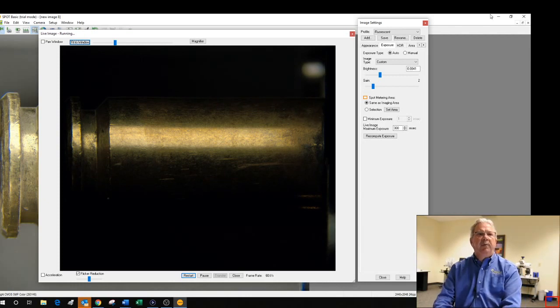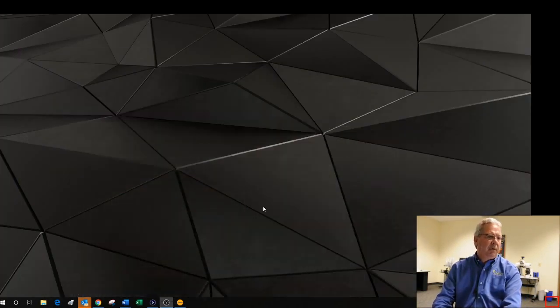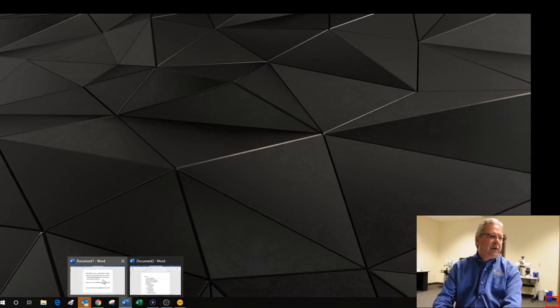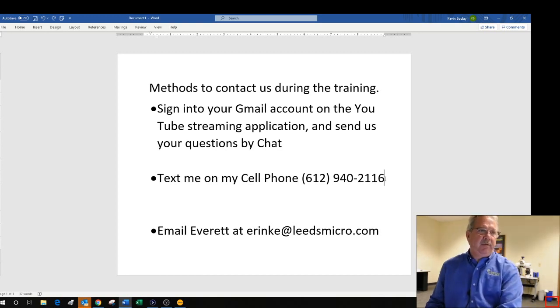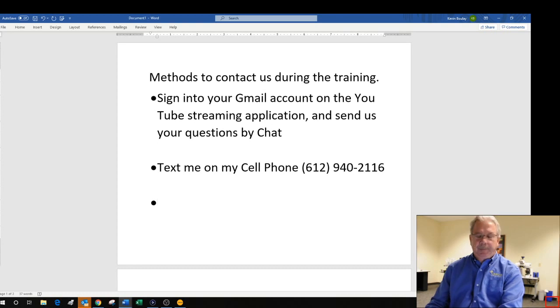I'm also going to take a moment, if any of you haven't had the opportunity, one of the other reasons, besides this camera being made locally here in the United States, one of the other reasons I really, really like the Spot cameras is their customer service support. And the idea that they'll do special and unique things for leads like this HDR button for cylindrical samples. Their customer support lady is a lady named Tina, literally one of the best 2 or 3 customer service agents I've ever worked with in my life, privileged to work with.